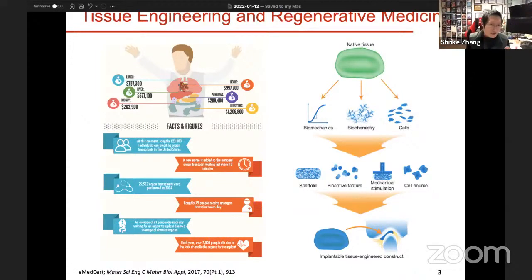But also you can imagine all these different fabrication technologies that you use for tissue model engineering can also be adapted to the conventional tissue engineering aspect, meaning that you can also start to fabricate these human tissues and organs that are functional, structured, relevant for regeneration purposes. But these are more longer term goals, because in this case, you have to really make sure that every single tissue or organ that you make is going to be 100% functional before you actually put them back in the human system, whereas in the human tissue model engineering perspective, you don't have to achieve 100% functionality, but usually 80–90% of functionality is going to be more or less sufficient.